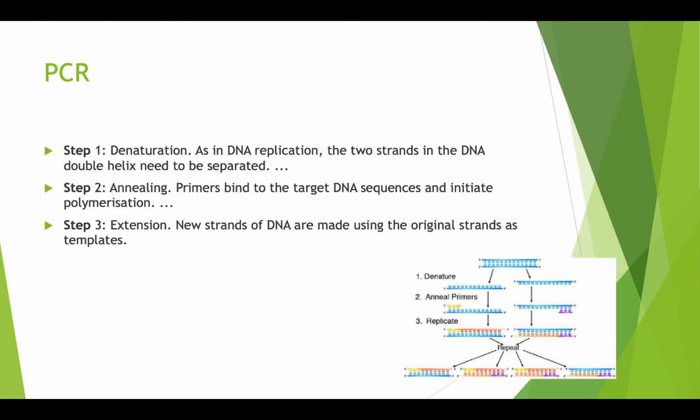Now all this takes us to PCR. What is PCR? So now you have your DNA template. You extracted it.